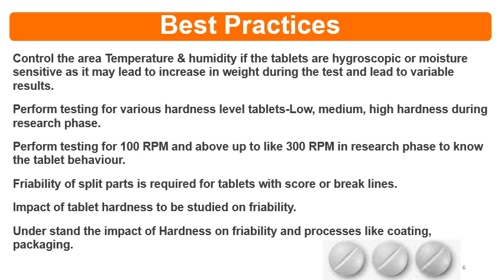So also perform testing at 100 rpm and above, up to 300 rpm or 500 rpm, in the research phase to know the tablet behavior.